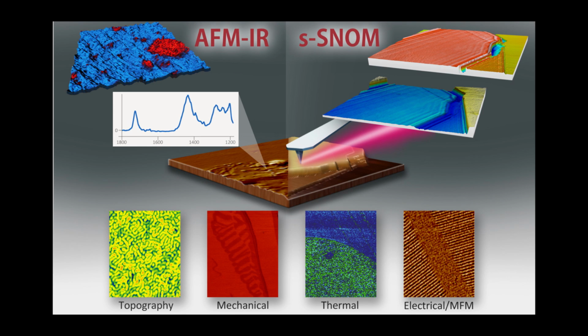We have a question that says, in SNOM, the IR peak position shifts with changing sample thickness. Do you observe that? So yes, the questioner is correct that in SNOM, because it's a scattering process, the IR peak absorption or peak scattering positions can shift with both sample thickness and substrate and material. This has been very nicely quantified by a paper from the Hillenbrand group.